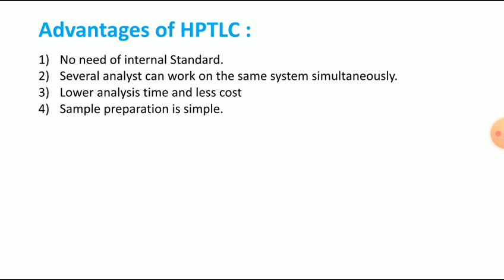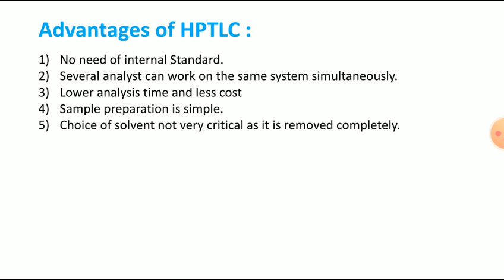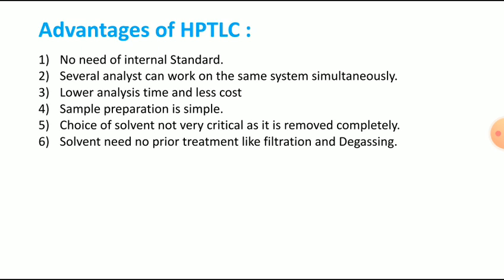Fifth one will be the choice of solvent, not very critical as it is removed completely. Sixth one, solvent needs no prior treatment like filtration and degassing. See, in HPLC we have seen the degasser system, for what?